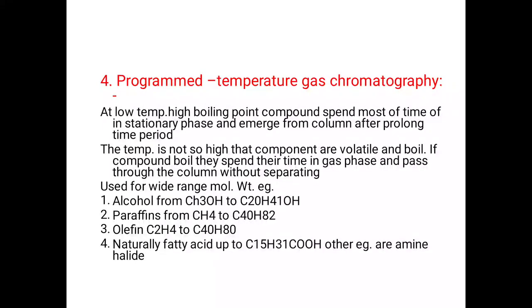In order to obtain a reproducible analytical result, it is necessary to control the temperature of the column very carefully. The temperature directly affects the tendency of organic compounds to enter the gas phase and therefore affects the distribution coefficients. At low temperature, high boiling point compounds spend most of the time in the stationary phase and emerge from the column after a prolonged time period.